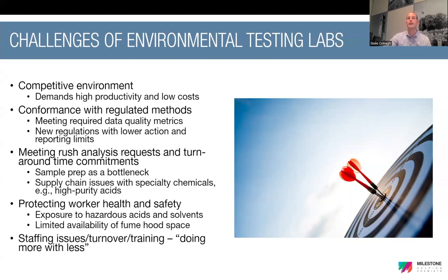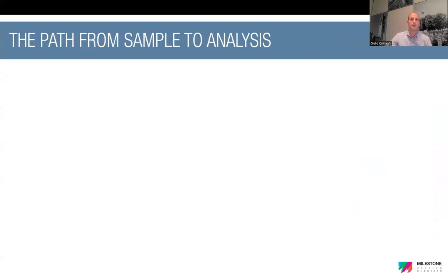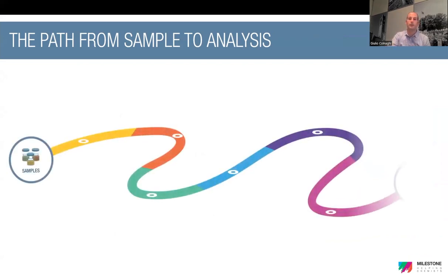So it's a very complicated environment in which the lab has to move, and therefore looking at new solutions and looking to address the entire workflow is pivotal to secure a better balance for the lab. When we look at the journey from sample to analysis, we have our samples, and there are several steps to get to the analysis.